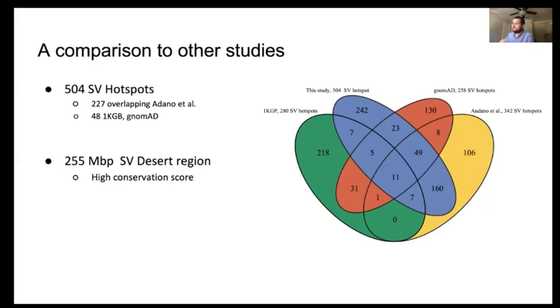One of the things we think is that these large short read studies are often missing something very systematically, whereas the long reads have a better characterization across the genome and therefore also detect more structure variants. So we have a high overlap here. Sorry about the time, I'm trying to show you multiple interesting aspects of the study, but the paper is currently in review, so it will hopefully be out soon.